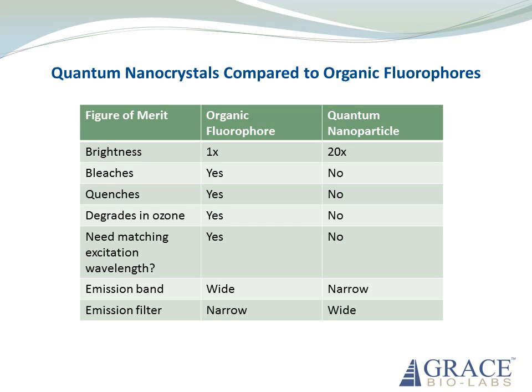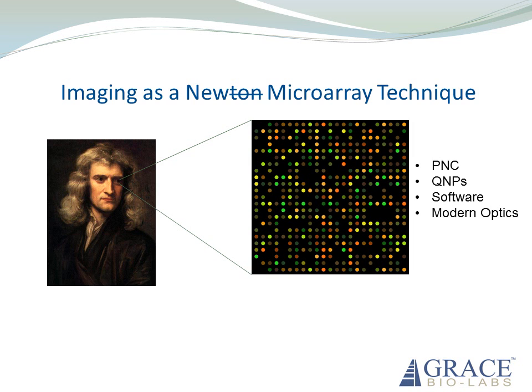Earlier, we mentioned that quantum nanoparticles should not exhibit quenching because of the small overlap of absorption and emission bands. We have experimented with quantum nanoparticles in our laboratory and have verified that by scanning of spotted labels using an ultraviolet laser source, the emission continues to increase with stimulation light intensity up to 1 watt per centimeter squared. In addition, we have not noticed any measurable bleaching effects with repeated scanning.